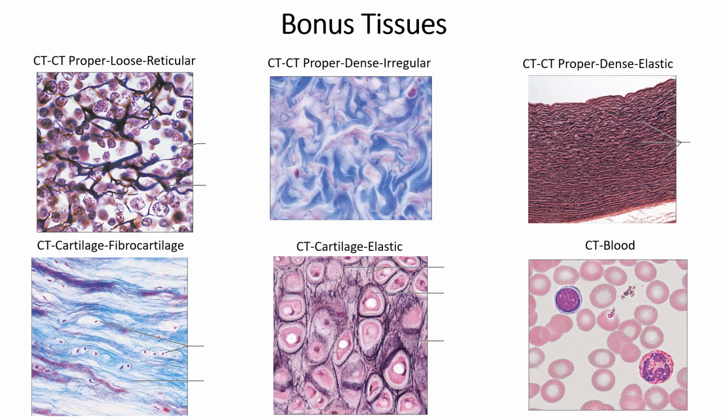We don't see that here. We see a lot of blue and a lot of purple and maybe some white peeking out between the blue and the purple. So not a lot of ground substance, not a lot of cells, but a lot of this blue and purple jumbled up mesh. The blue and purple are fibers, right?